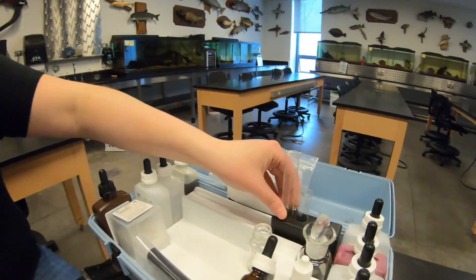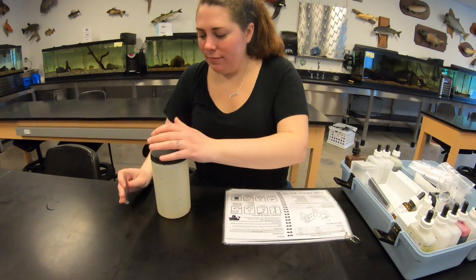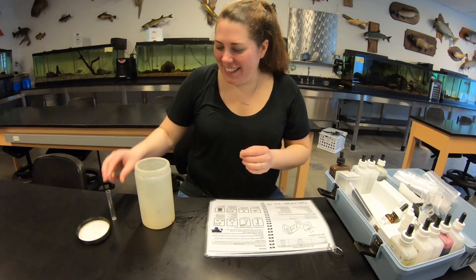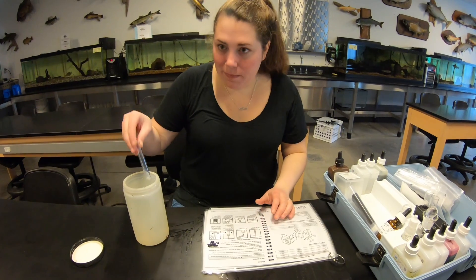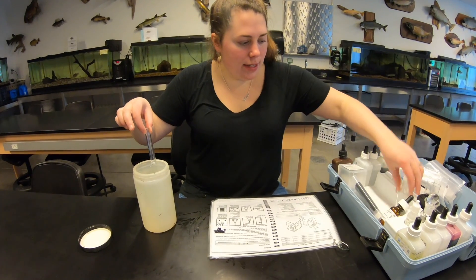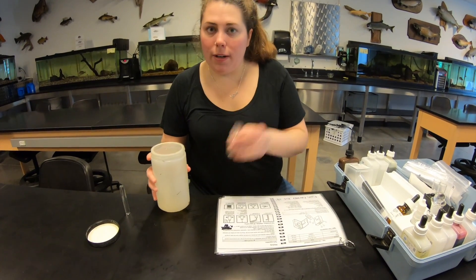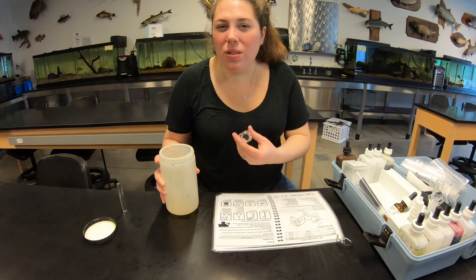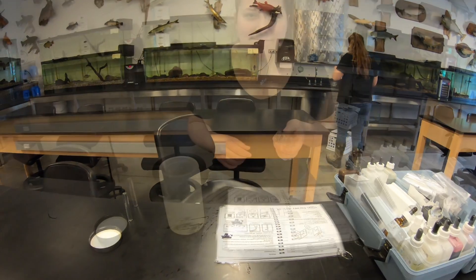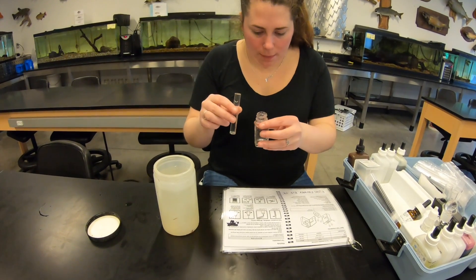So I'm going to take our water sample and open it up. We'll grab the measuring tube and fill it all the way up. I'm going to put some water in a test tube over the sink to wash it out so there's no residual chemicals from last time. Now that it's all washed out, I'm going to take this measuring tube and pour it into our mixing bottle.